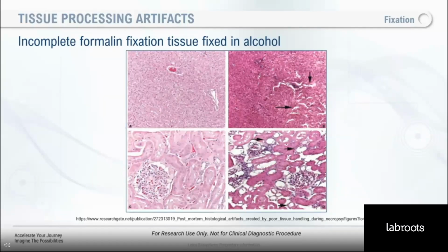There is excessive shrinkage and hardness of the tissue, which makes it more difficult to section. And usually on the microtome, you might see thick and thin sections where you might end up on the slide with a thicker section than usual. Usually you're cutting anywhere from 3 to 5 microns, and so the stain is going to be heavier. Also here, and this is a whole other subject, but when you have overfixation and overprocessing, you have the possible loss, of course, of bound water.